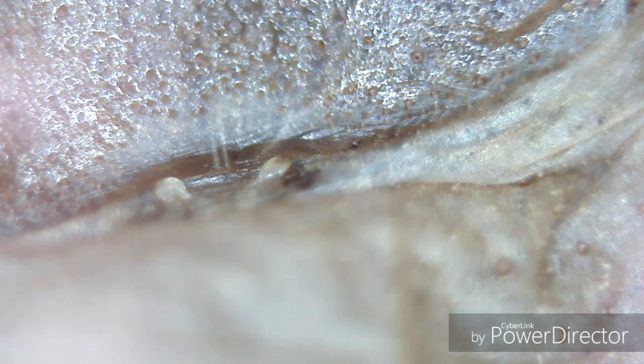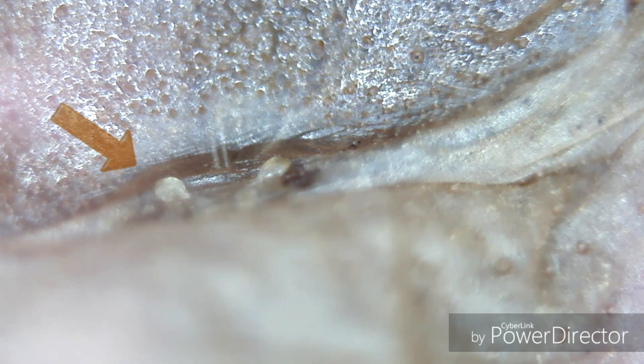What's up, tarantula YouTube — Tennessee Tarantulas is back with you here. We're sexing my two-and-a-half-inch Nhandu chromatus, and as you can see plainly from the spermathecae and the fold — the epigynal furrow, I can't pronounce that word — but anyway, yeah, as you can plainly see, it's a female. I love this little microscope, it's absolutely amazing.